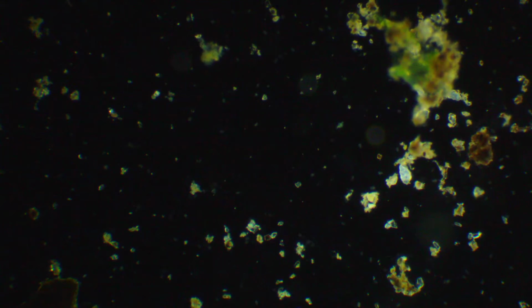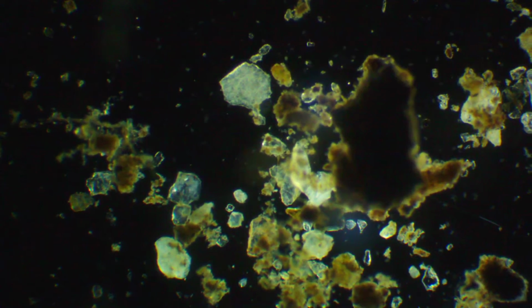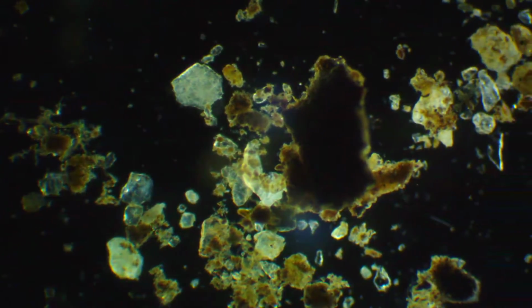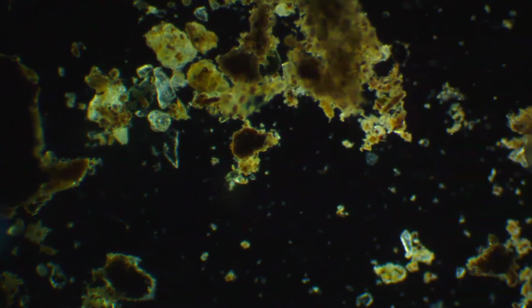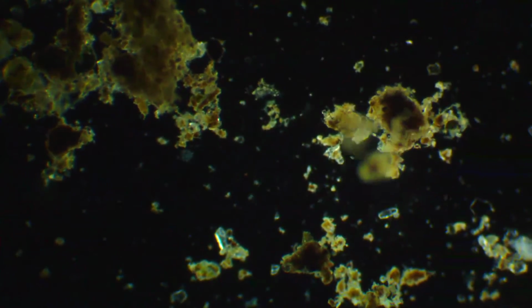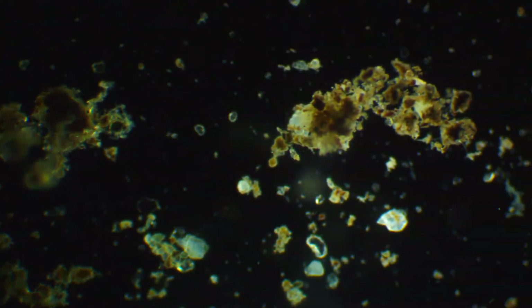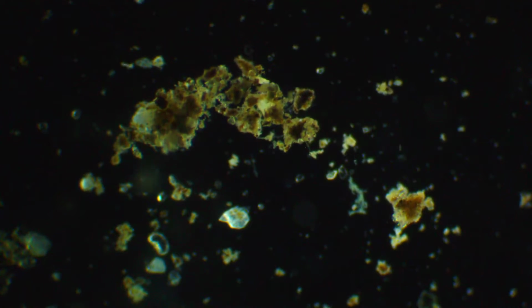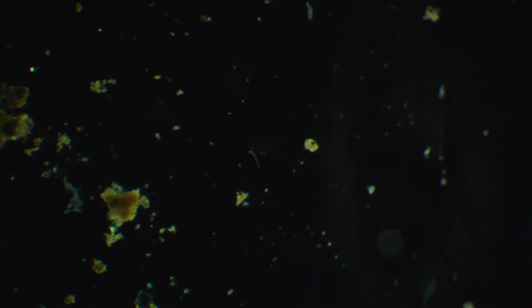That's just a grain of sand. Again, this is moss growing on dirt, dropped into some water, distilled water, and let soak for several days. And this is what you kind of get. Interesting.